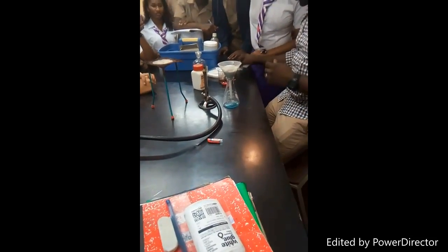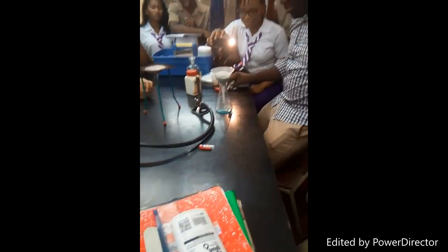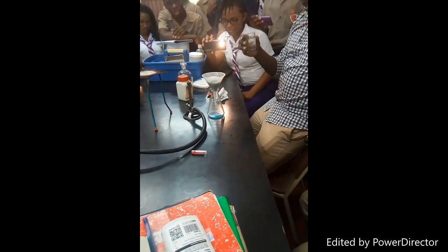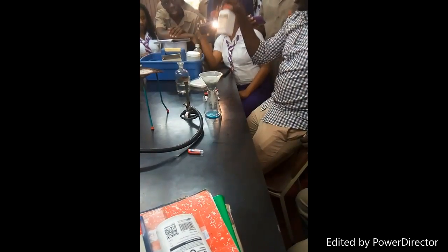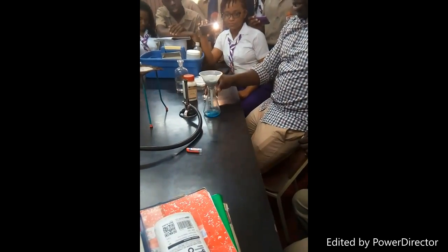So you notice here your filtrate, which is the substance coming through the filter paper, is blue. That's because the copper that is formed here is copper 2+, and the copper from the cuprous oxide is copper 1+, and they have different colors.